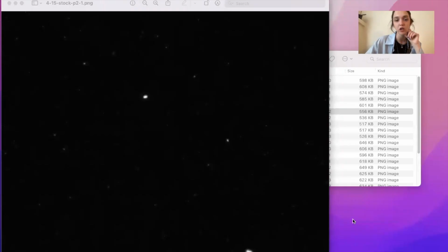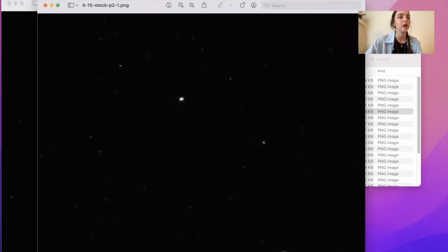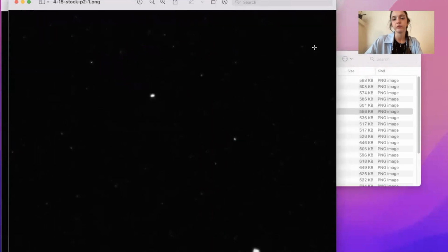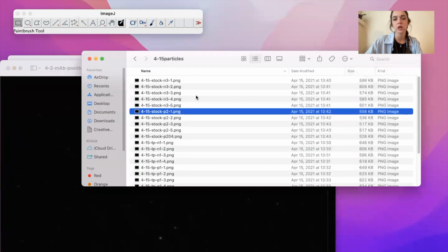Okay, so if we were looking at this on the benchtop microscope, if we were looking at this thing here, that would be green. Oh, I can't even describe it. I think it's one of the most gorgeous things ever. It looks like sparkling stars in the galaxy. Like, who needs to visit a planetarium when you can visit the microscope where you are all the time?